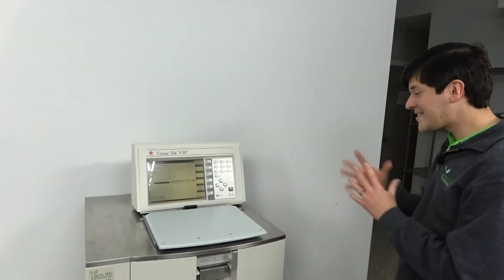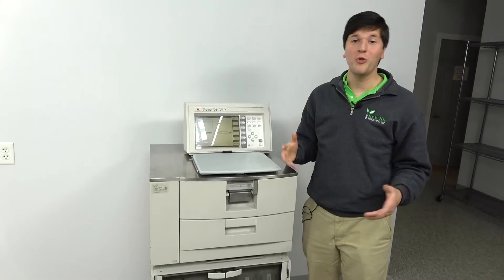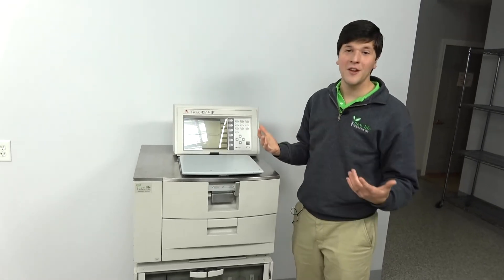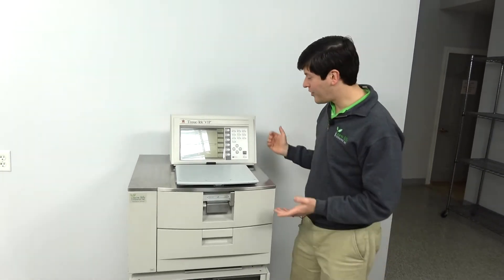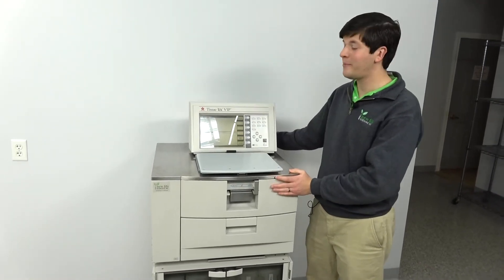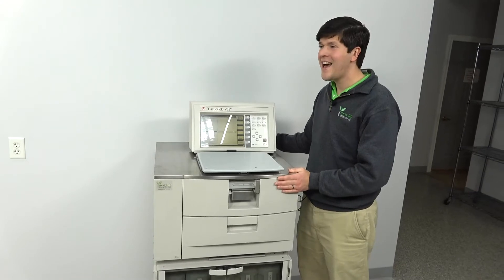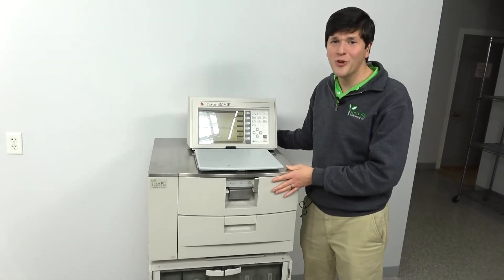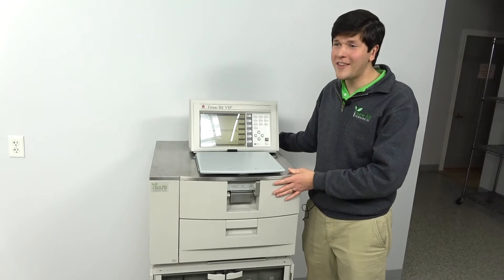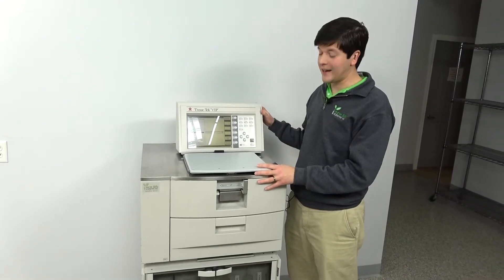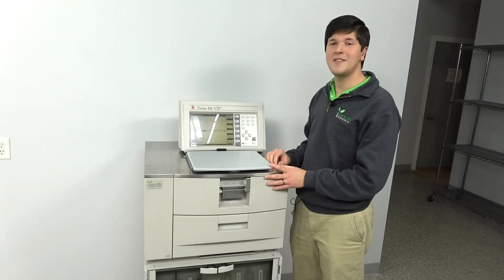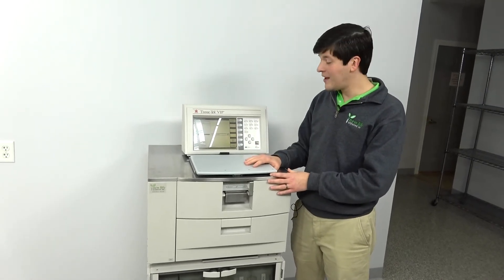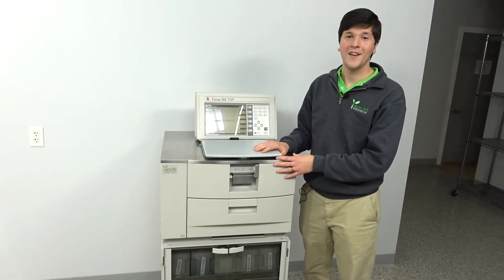So that's it. This is the VIP-5 in good condition ready for you who are sick of your VIP-2000 or VIP-E300. For those of you that know Sakura, you know these things are longevity powerhouses. Sakura builds really hardy instruments and you'll still find VIP-2000s that were made 30 years ago in labs today or even on the used market and people still want them. So you know with Sakura you're getting some good value. You're getting something that's going to sit in your lab for quite some time and be a good addition to your process and your instrument selection.